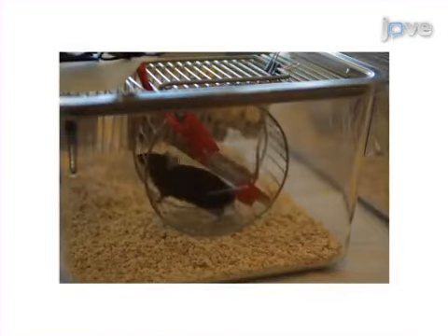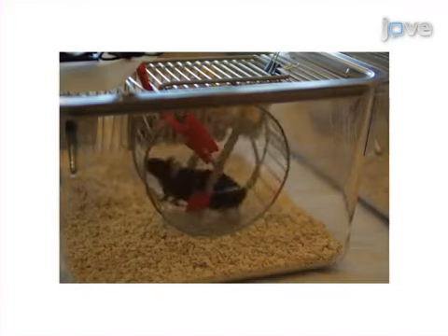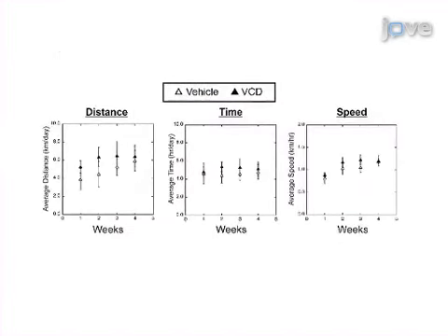such as voluntary cage wheel exercise and cardiac adaptation. Ultimately, voluntary cage wheel activity and cardiac adaptation is used to show whether menopause decreases cage wheel activity.